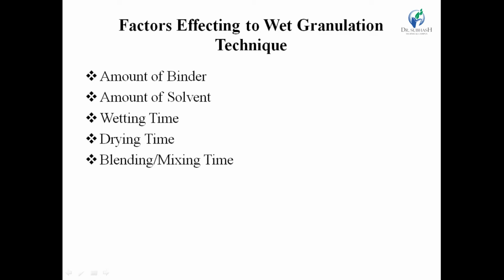If the mixing time is lower, it affects content uniformity, and prolonged mixing time results in segregation. Prolonged mixing after adding a hydrophobic lubricant affects disintegration and dissolution time. So proper drying time and mixing time should be maintained.